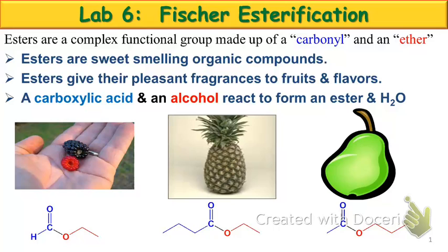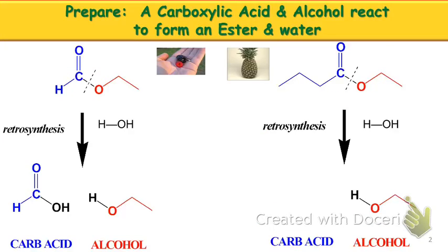Okay, so Fischer Esterification is the lab you guys are going to do. You're going to make an ester. Esters are sweet-smelling compounds, typically, so you'll see them in a lot of fruits. If you look at berries, pineapple, and pears, the compounds underneath those are what make those scents, or the characteristic smell from each of those.